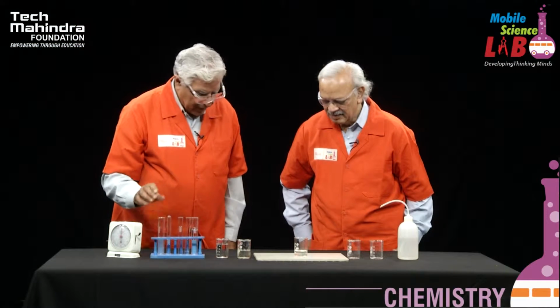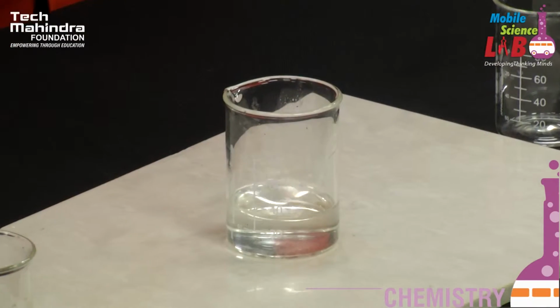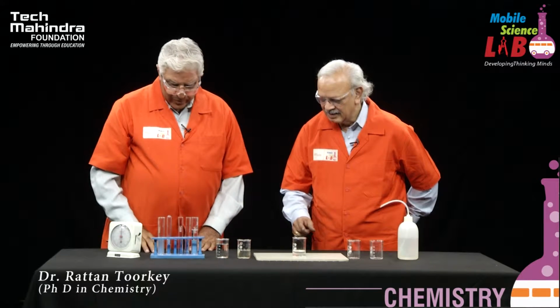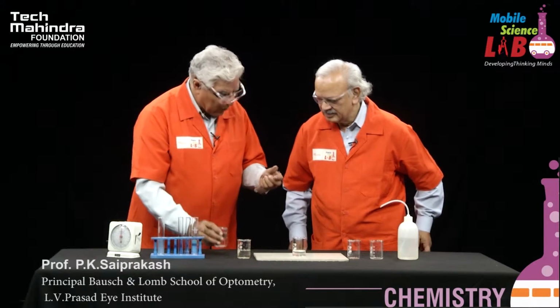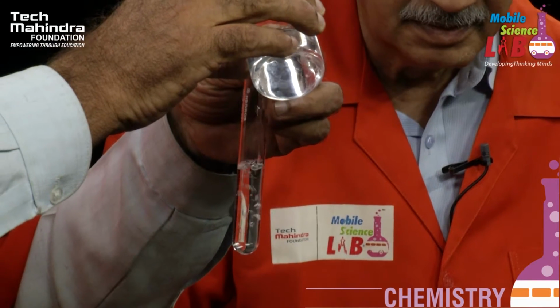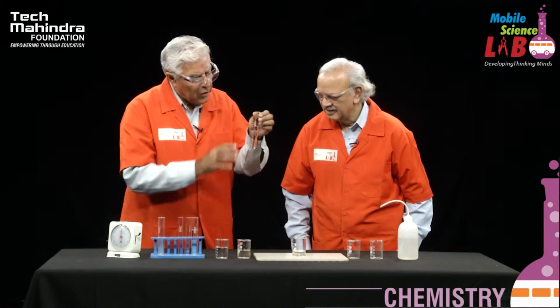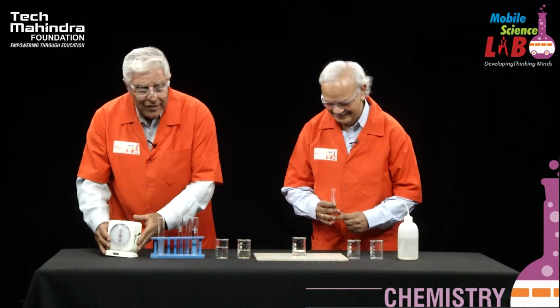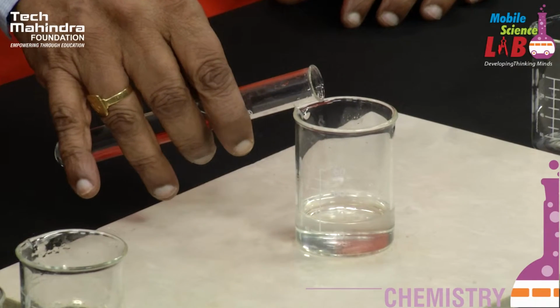All right. Now, in this, what all do we have? Potassium persulfate is there. Sodium thiosulfate is there. Starch is there. The only one to be added now is potassium iodide. Okay. Take it in there, the same quantity as you have taken for persulfate. Right. So I am taking potassium iodide solution, as you can see over here, almost the same quantity as potassium persulfate. And now, when Professor adds this into it, I will start my reaction and I will hold the stop clock. Ready? Ready?